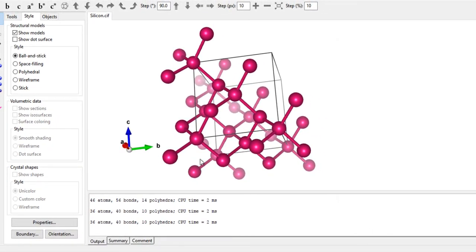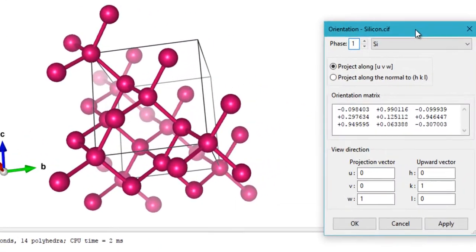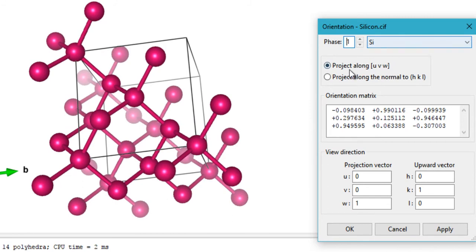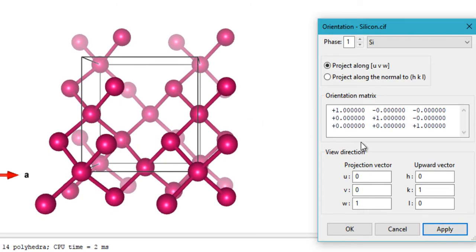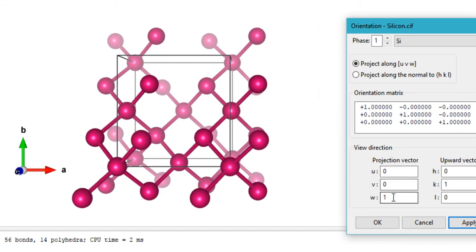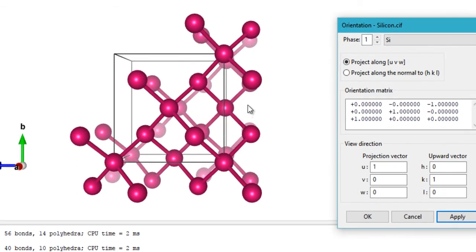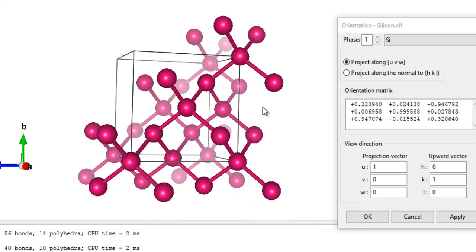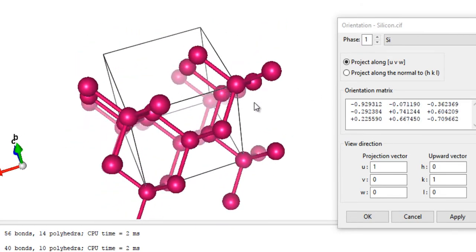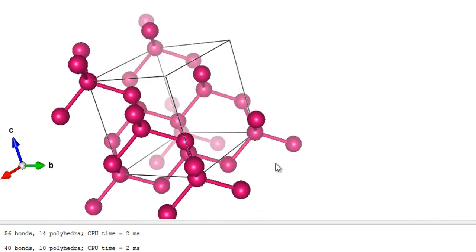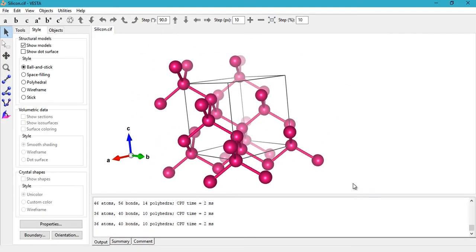The Orientation tab lets you set the orientation of the unit cell, projecting it along normal lattice vectors or reciprocal lattice vectors specified by hkl indices. The orientation matrix updates as you move the crystal. For example, when oriented along the C-axis, the matrix reads 0 0 1. I don't think this feature is used very often.